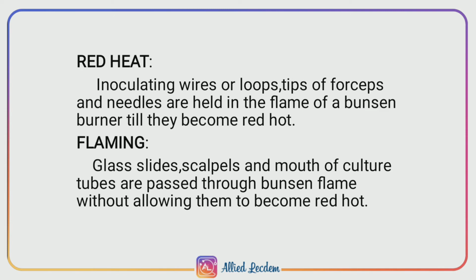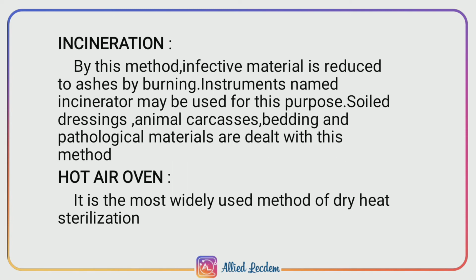Incineration. By this method, an instrument called incinerator can be used to reduce an infective material to ashes by burning. Soiled dressings, animal carcasses, bedding, and pathological materials are dealt with this method.